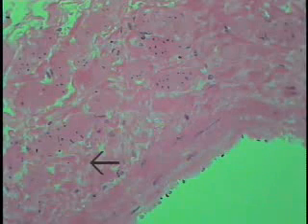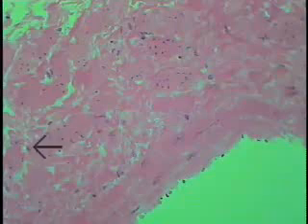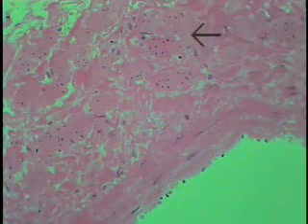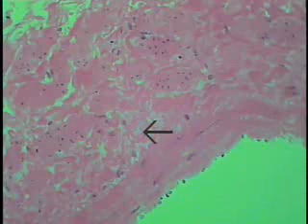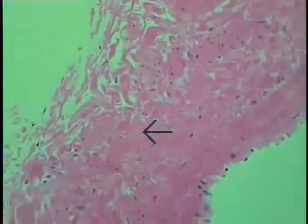One can see collagen. The elastin tissue is probably hidden in the background, maybe staining a bright color, but we can't really resolve it at this particular field. These structures here are bundles of smooth muscle that are running parallel to the lumen, I should say, and have this open spiral course around the vessel wall. So it's the tunica adventitia that is the preeminent feature of these very large veins, and they do have a muscle component, though it's not as tightly organized, let's say, as on the arterial side.